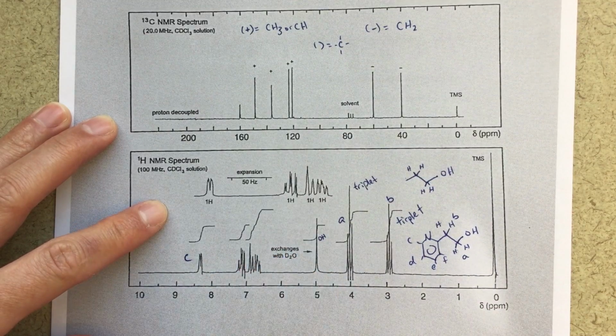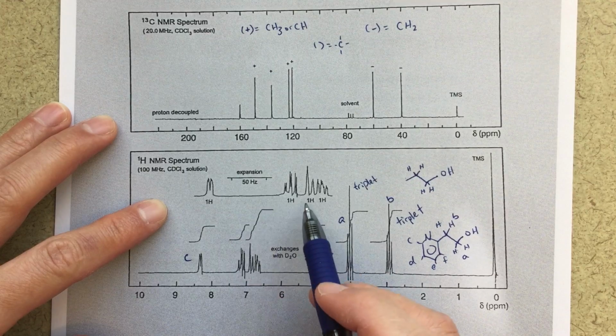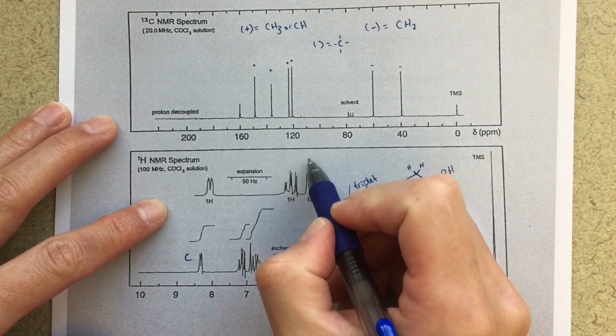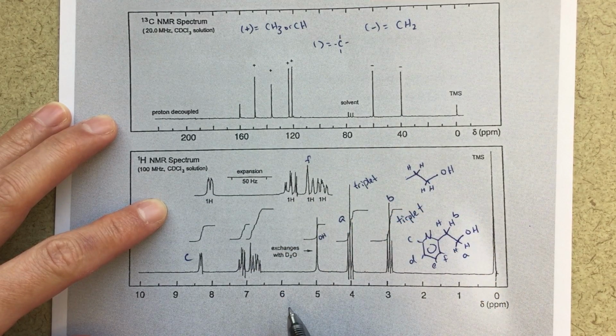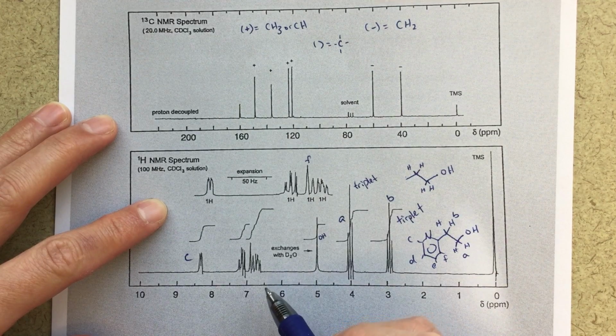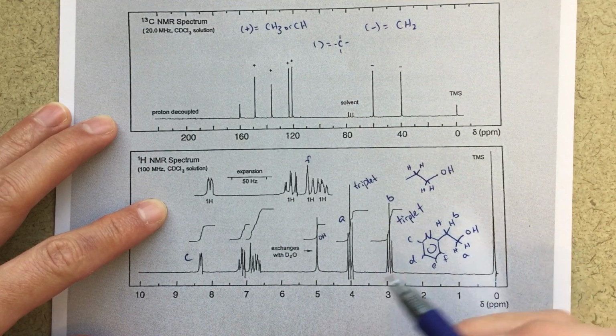This will be C. Now D, E, and F, I think, are complicated and it's unclear what's going on here. I might call this F, it looks like this might be more of a doublet. E and D, I really don't know. E might be, well, it's hard to tell. It's really hard to tell.